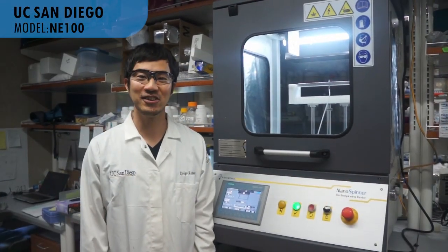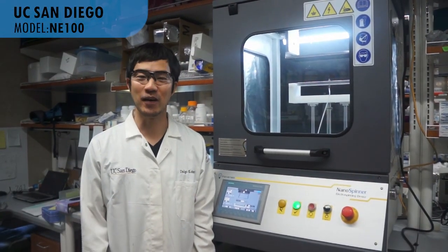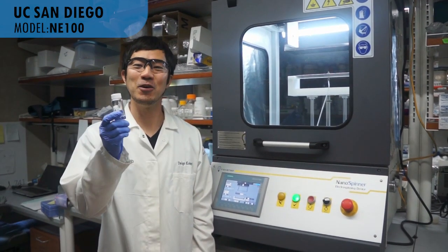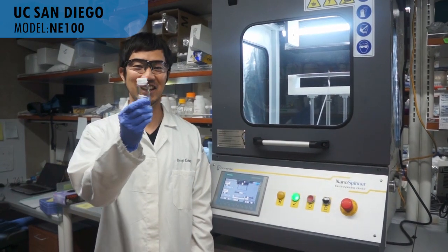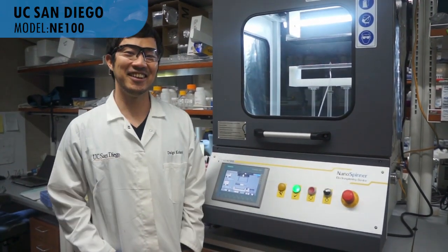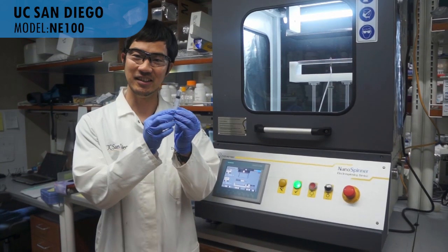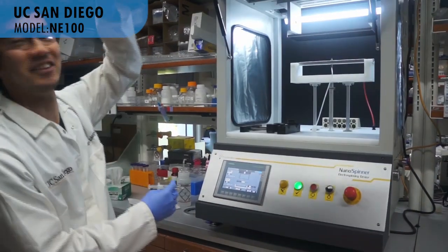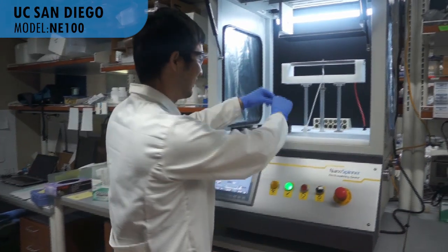Now I'd like to show you how to make fibers. First, dissolve your polymer in solution, like this. Second, put the syringe filled with the polymer solution into this device, like this.